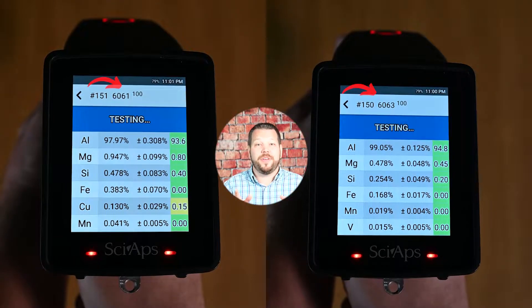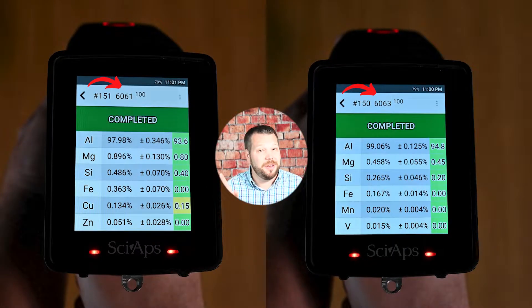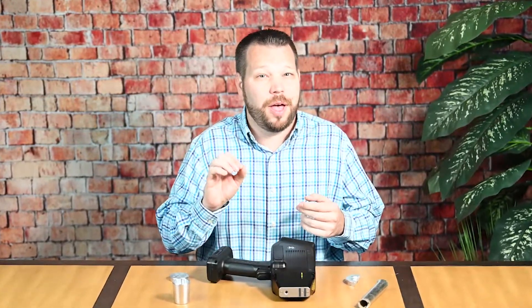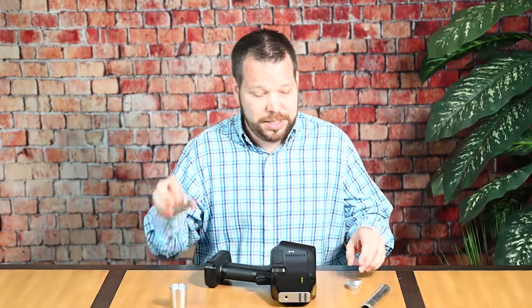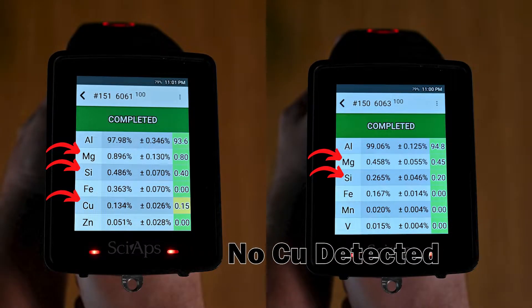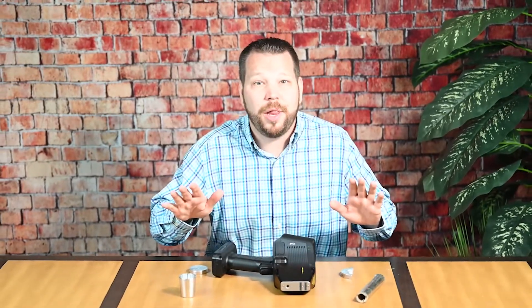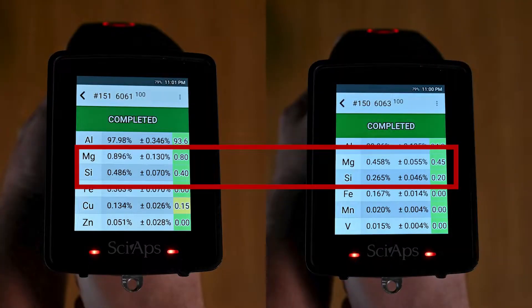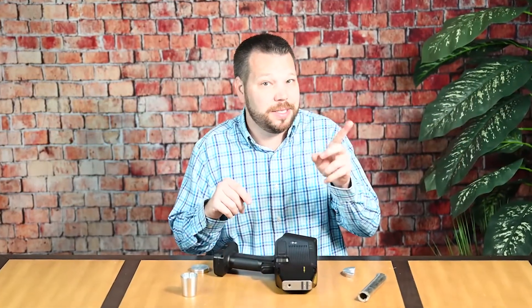First, let's note the great identification of both alloys, as we have a good match here in each case. To understand how our metal analyzer identifies these alloys, let's take a closer look at their chemical compositions. For 6061 and 6063, we need to look at three primary elements: silicon, magnesium, and copper. The chemical aims for silicon and magnesium are similar for both alloys, with 6061 having more silicon and magnesium than 6063.